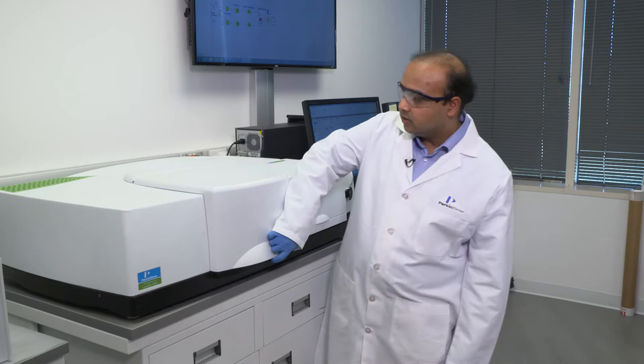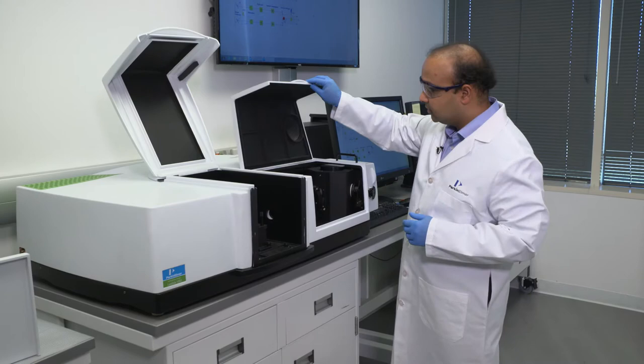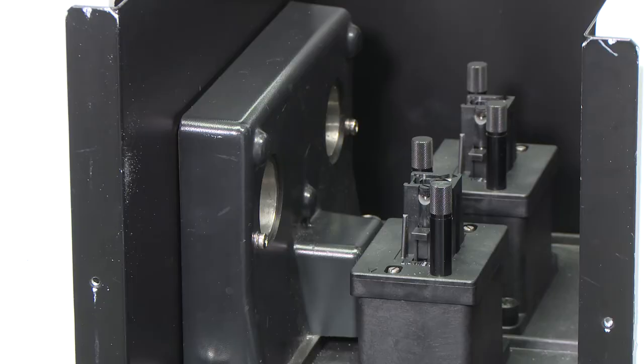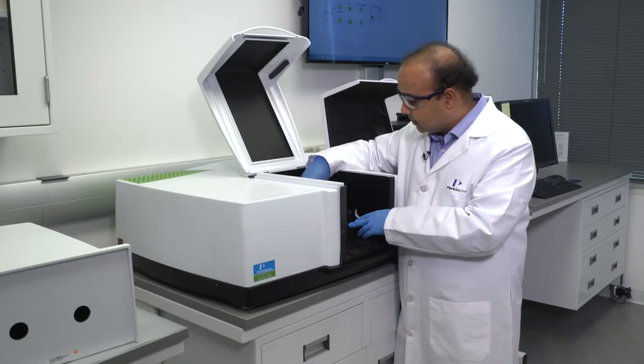Specifically, the accessory we're discussing today is our 150 millimeter integrating spheres. So on the Lambda 1050, there are usually two parts that we're going to draw your attention to. This is a modular arrangement here, the sample compartment here.